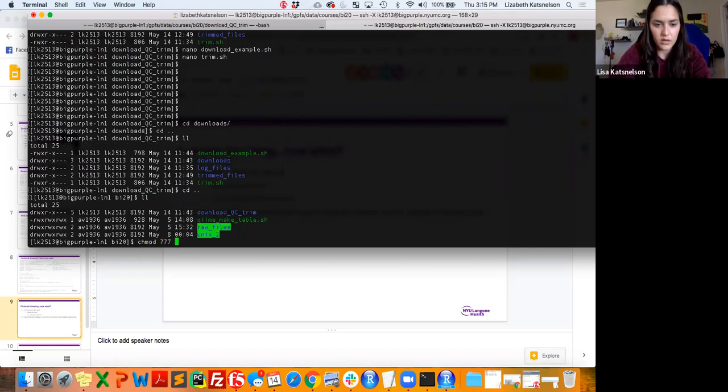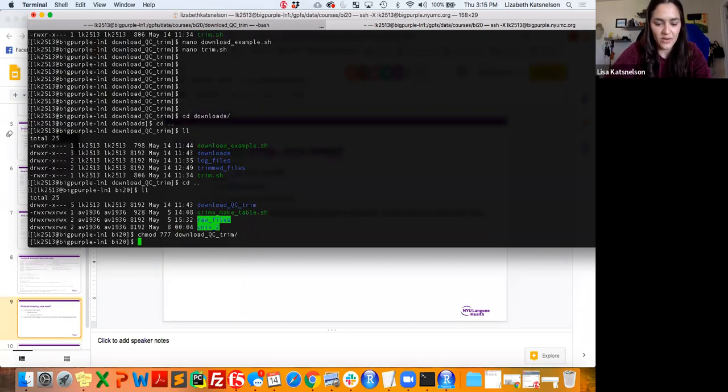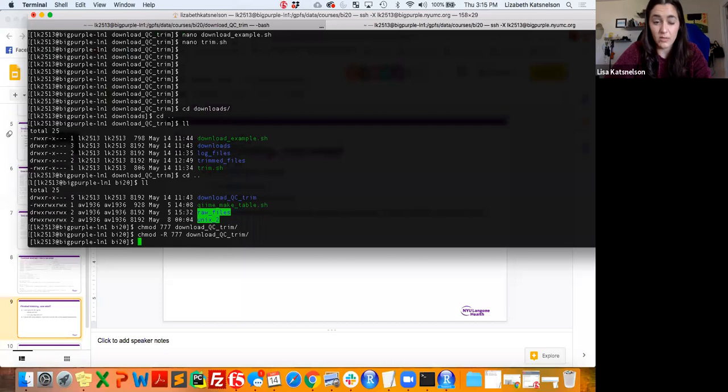I'm just gonna make it available. Just don't overwrite anything in this folder. And also please change the email to your email. I don't want to get 1,000 emails. Oh, actually, I might have to do, okay. You guys should be able to get it now. Sorry about that.